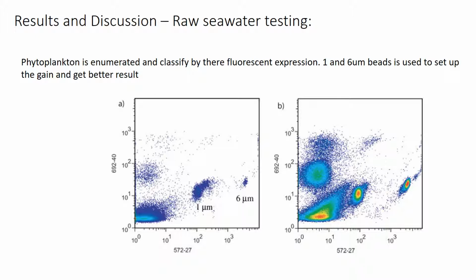Again, the virtual core cytometry result reproduced the general shape of the plot and can be used for enumeration and ratio concentration measurement of the particles or cells. Compared with the traditional cytometry, which is the gold standard, this new method presents a possible solution to the problem of using a lot of liquid in the sheath, while also providing the same results, which differentiate the size and the number of the cell particles.